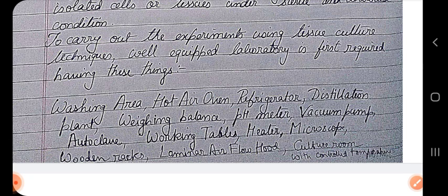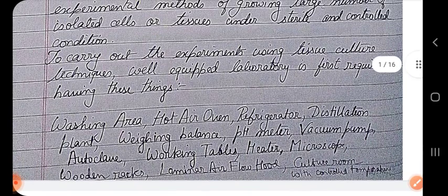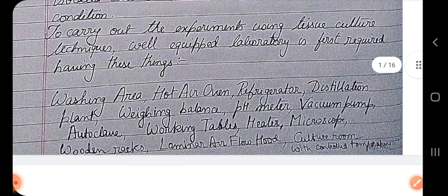Later on you will see what the accurate pressure and temperature needed are, and it is maintained for 20 minutes actually. Normally in microbiology we maintain them for 15 minutes, but here we will maintain them for 20 minutes, right? Then working tables, obviously they should be neat and clean, free from contaminants. Obviously the working table for plant tissue culture will be separate from the microbiology one, otherwise contamination will occur.